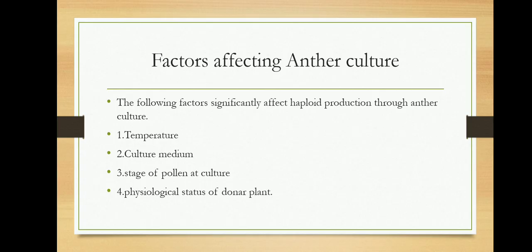For anther culture, we should take anthers from young plants or from short day plants, because these are the responsive anthers for getting haploid plants through the culturing process.